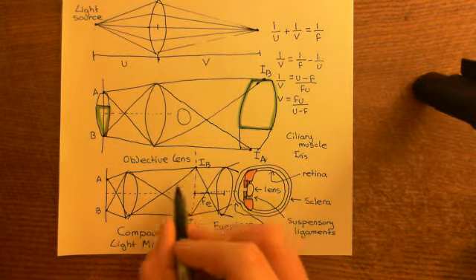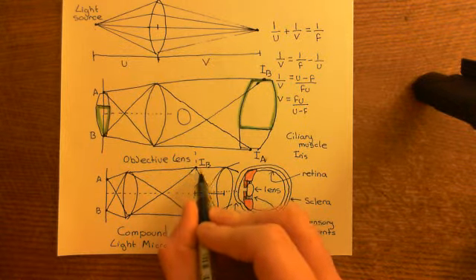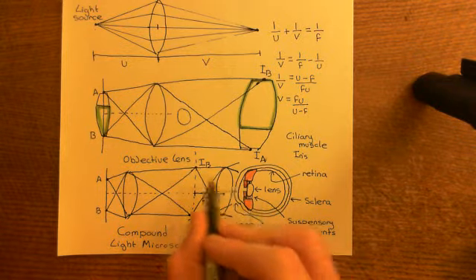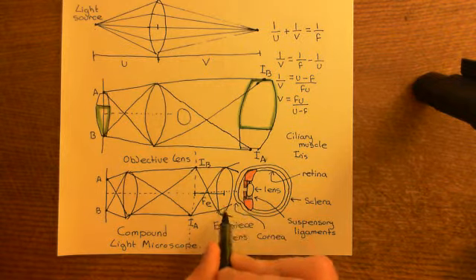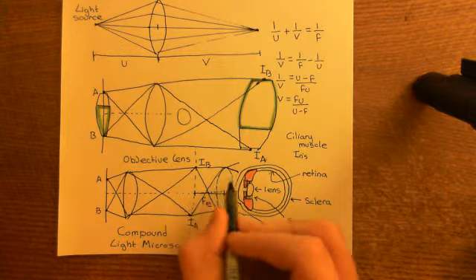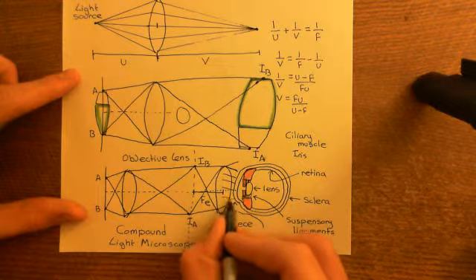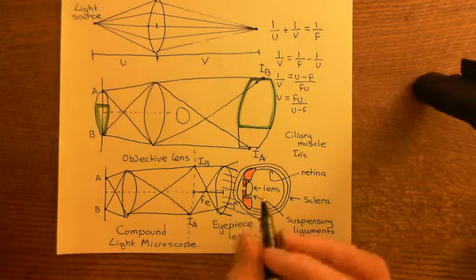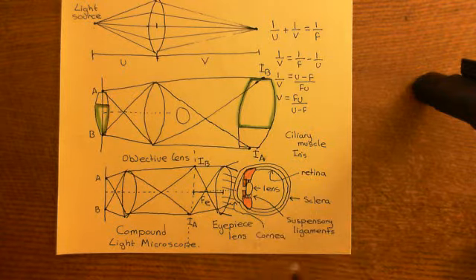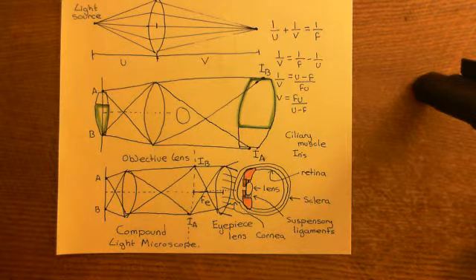Again, we have a plane of points here. Each point will have its light beams focused so that they are going in a certain direction, so each point will have a unique direction. For instance, point B here has this direction in which all of its light beams will be focused. Even though I've just drawn two, in fact there'll be loads of them, all going in a certain direction. Although I'm only drawing a 2D picture, of course it'll be a 3D direction. For every single point on that plane you'll have a unique direction.